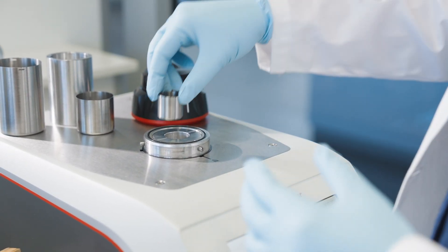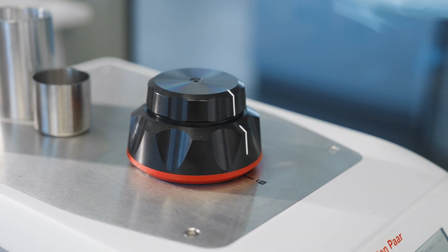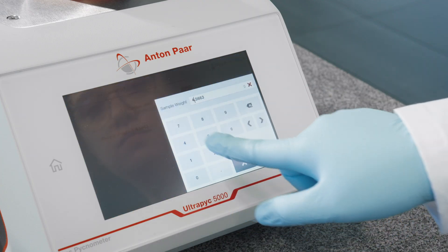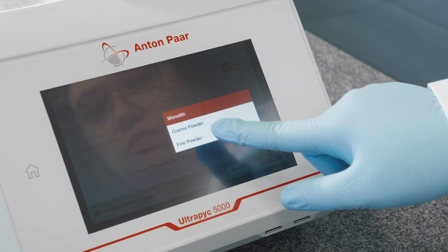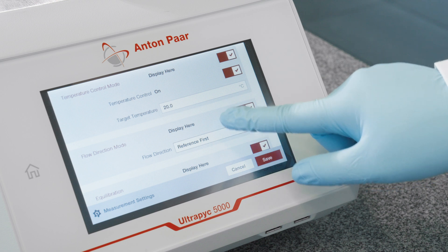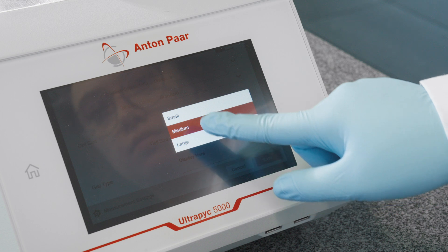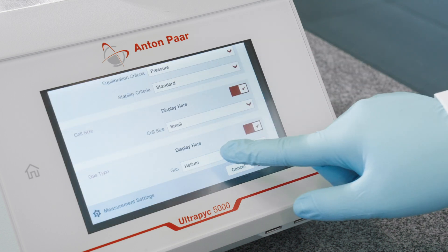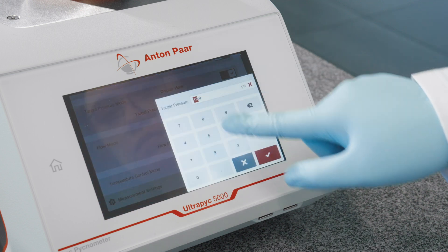Then, accurately weigh a sample into the gas pycnometer cell, place it in the instrument, and seal the lid. In the software, input the measurement parameters, including weight and sample type — which is powder in this case. Choose powder protect mode, which will avoid sample dispersion or spread and protect the instrument. Select analysis gas, which is helium in this case, then set the pressure to low for powders so as not to compress the sample and affect the density value.